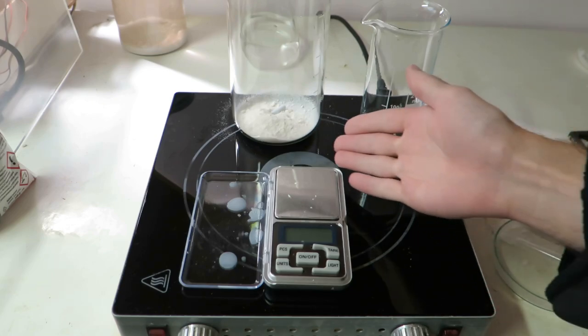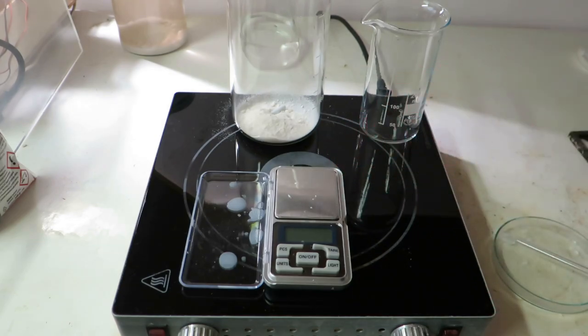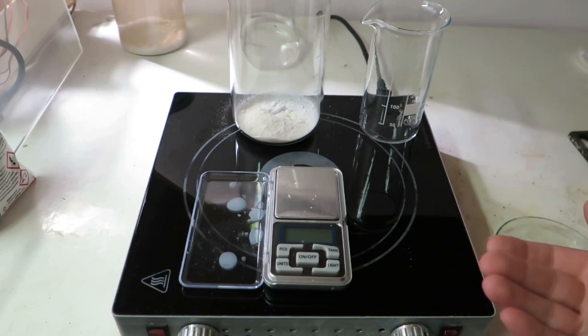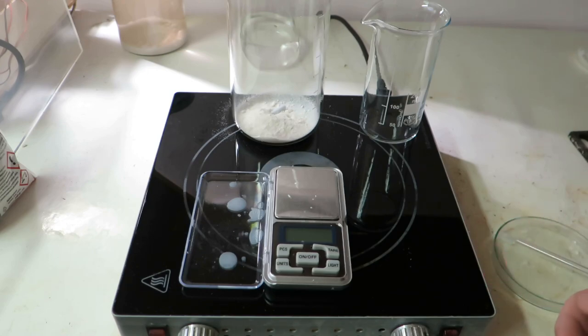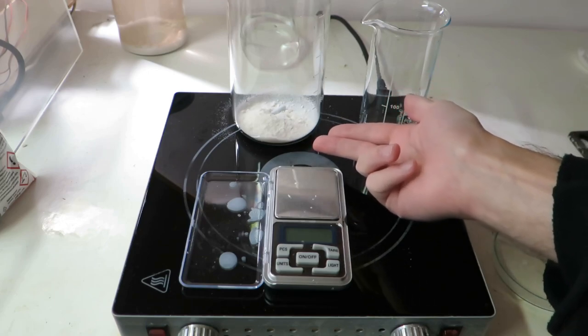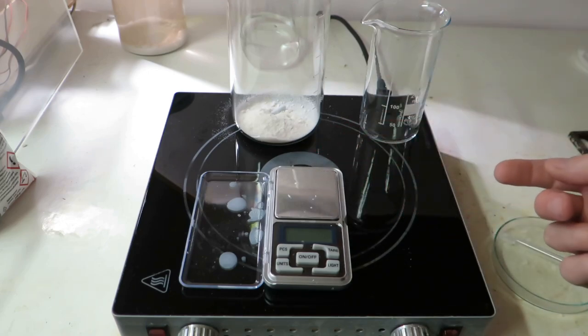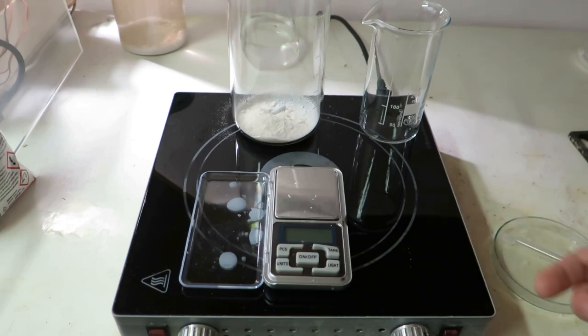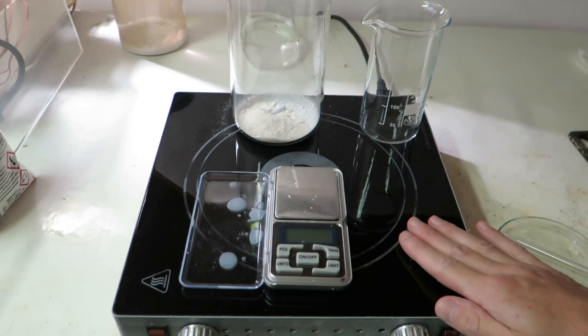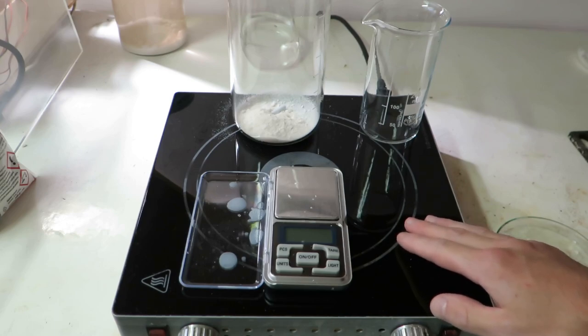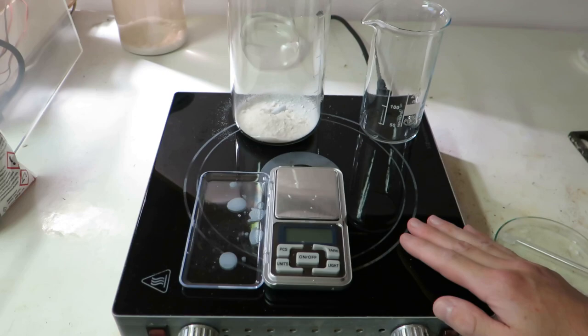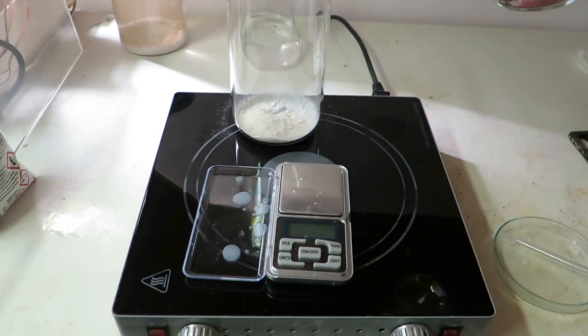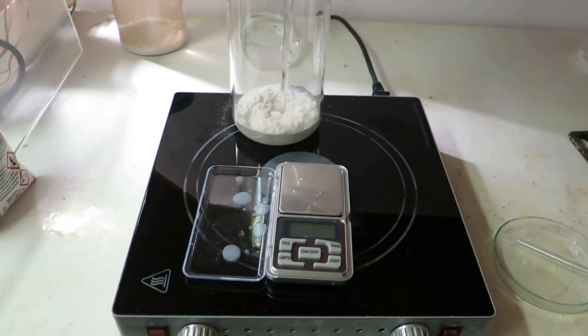Now the question is what is the best way to neutralize the benzoic acid with calcium hydroxide, because calcium hydroxide is fairly insoluble and benzoic acid as well. I figured that probably best way would be to dissolve benzoic acid in water and then add hydroxide dispersed in water slowly. Now the calcium benzoate is soluble in water. I guess I will start with benzoic acid, we will add about 100 mls of water.